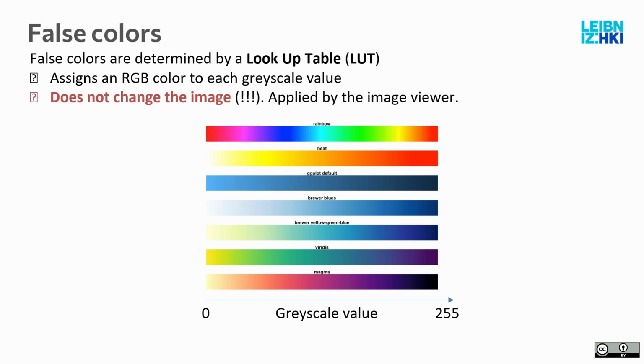And here are some nice colorful ones that might or might not be helpful depending on what kind of data you're looking at. For example, JIPipe likes to use this viridis pattern as default, in Python also. And ImageJ comes with loads of them. They're in a menu, LUT, and JIPipe also has them. So you can play around, make some visualizations, which is also part of some exercises, to make such visualizations with nice colors.